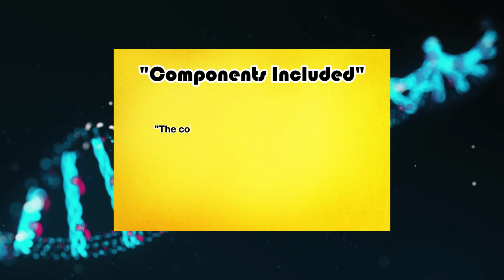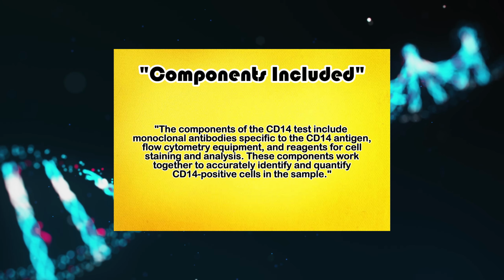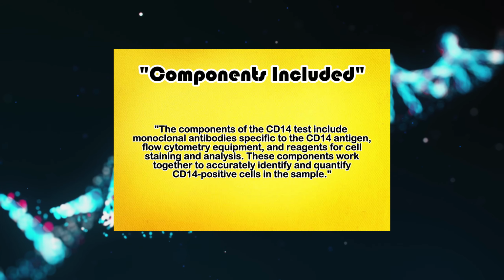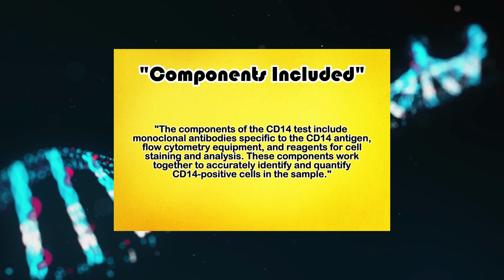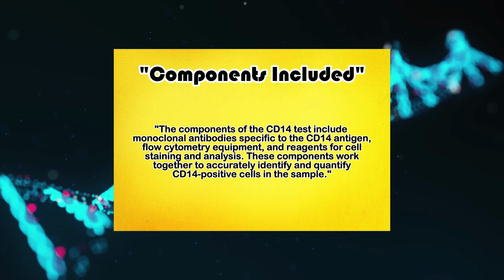Components included. The components of the CD14 test include monoclonal antibodies specific to the CD14 antigen, flow cytometry equipment, and reagents for cell staining and analysis. These components work together to accurately identify and quantify CD14 positive cells in the sample.